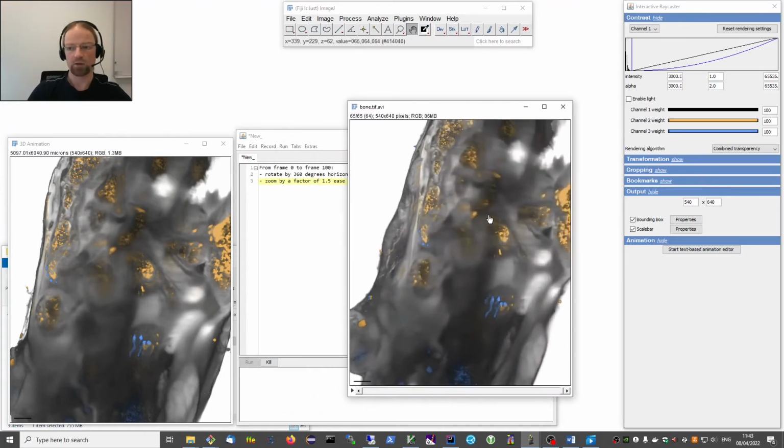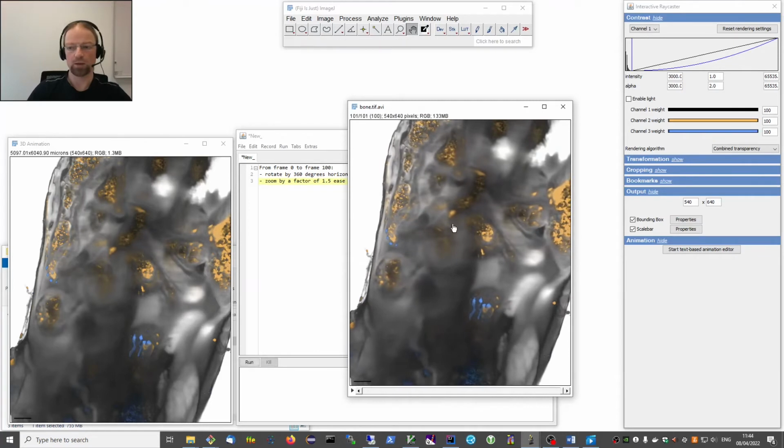By the way, if you're running something and you realize that it's not what you expect, you can always kill it. You don't need to wait for the full video to render. I guess we'll later have use for that probably.